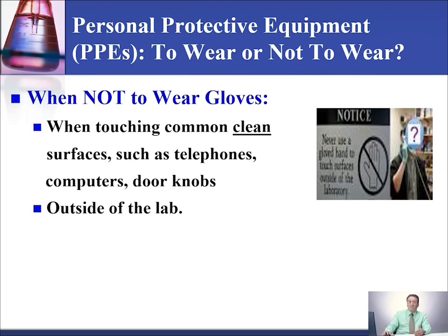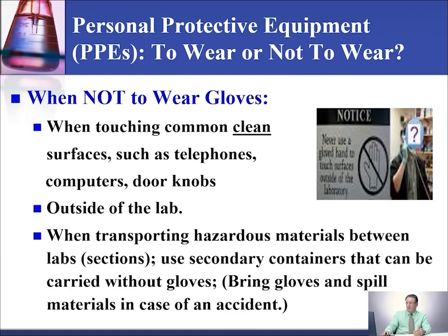Transporters, when they are transporting specimens from phlebotomy to the main lab or to a central area, cannot wear gloves between phlebotomy and the central area, especially if it's far. Okay, they have to remove their gloves and wear gloves again when they are dealing with the specimens again at the section or at the lab. Okay, I already told you that.